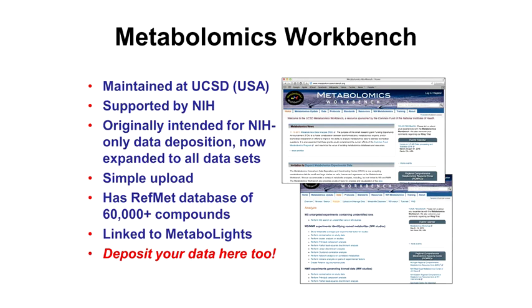So that is essentially a quick outline of how you collect data for NMR. We haven't talked about the details of how you do spectral deconvolution, and we'll explore statistical spectroscopy as well. So with that, we'll wrap up.